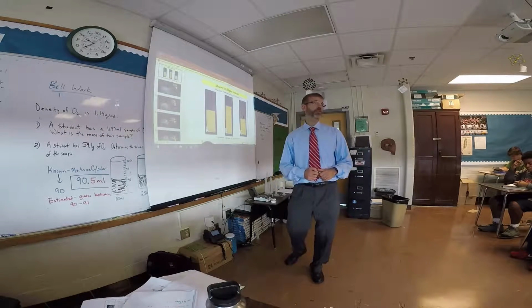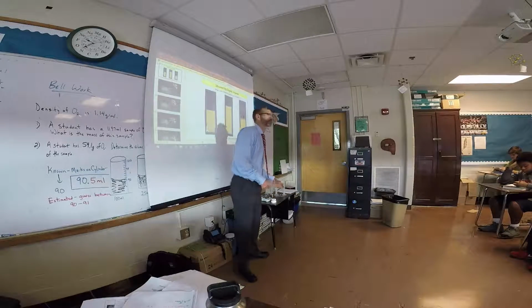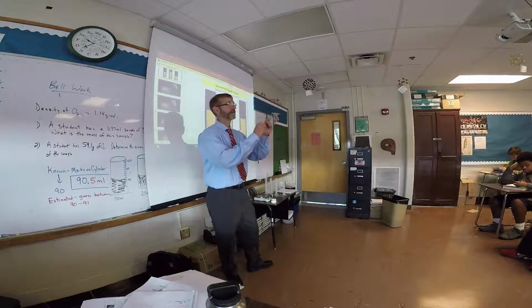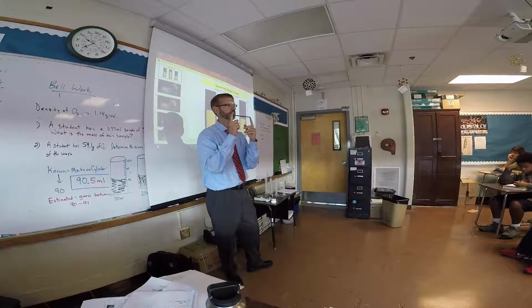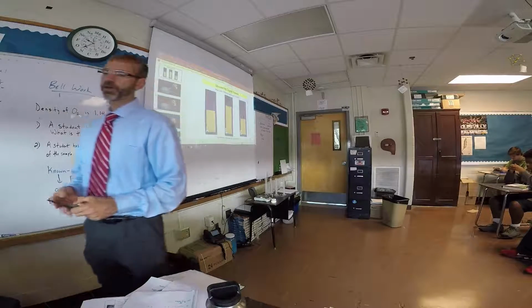So what we're going to do today is called the water displacement method. When you have an object like the crucifixion nail, right? That would hurt. It's difficult to measure the volume of this because you've got a curve here, you've got to do some calculus, right? And then you got this difficult object to measure. So we do what's called the water displacement method.